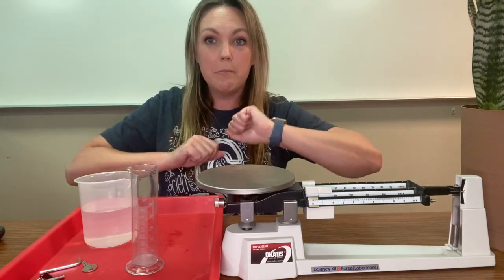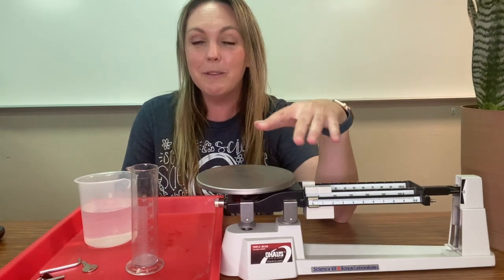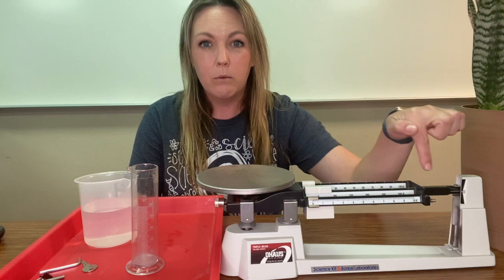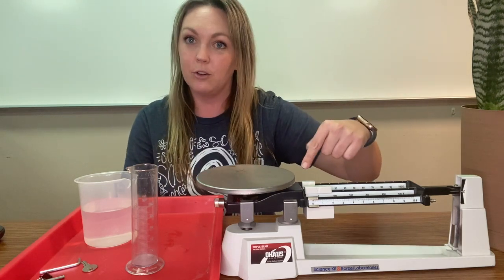This right here is a triple beam balance because there are three beams, and this is used to measure mass. If we put something on here, we're measuring against the balance of these triple beams and the weights that are on top of them.